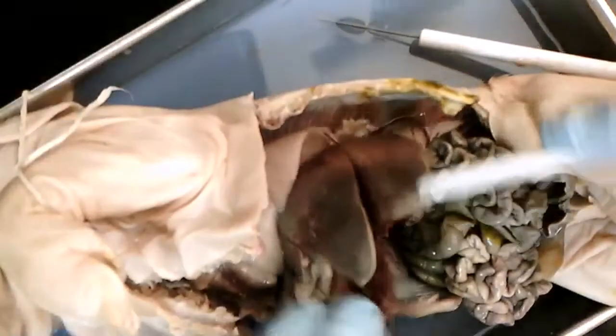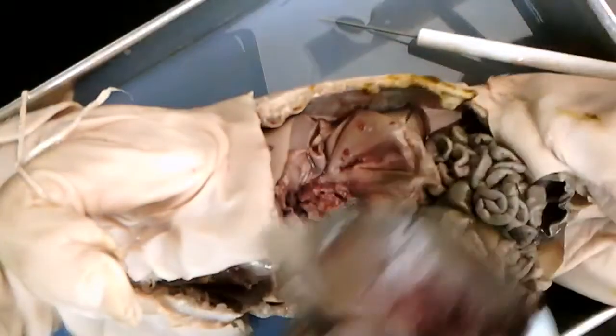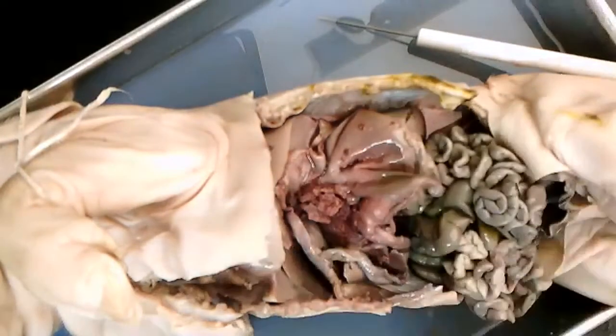Some other things, as he's doing that, that's nice to point out for students. Of course, oh, there you got it. Very good. Pretty large. And if you want to identify the different lobes, that's a great educational thing to do. I'm not going to ask that on the CDE, though.